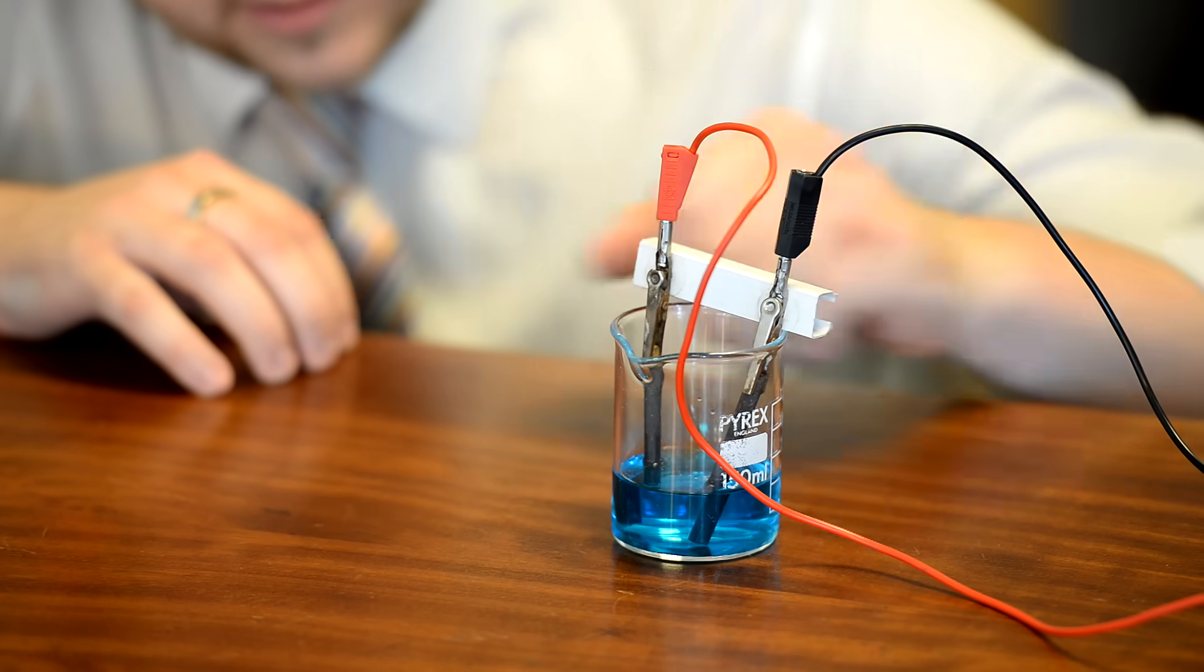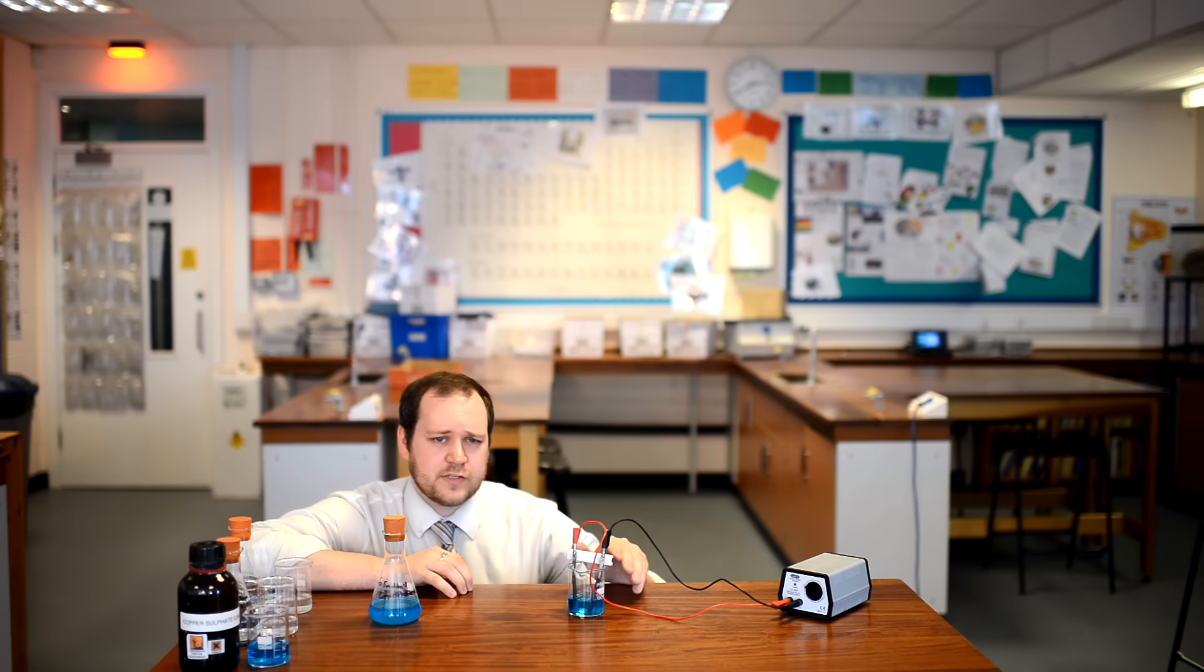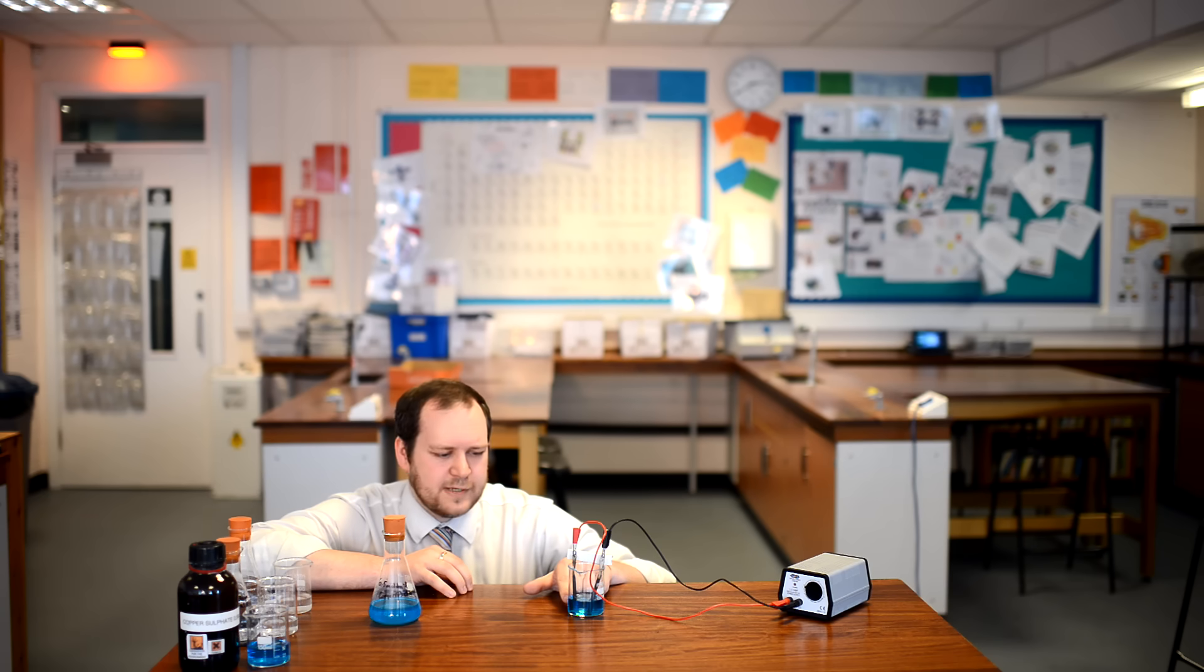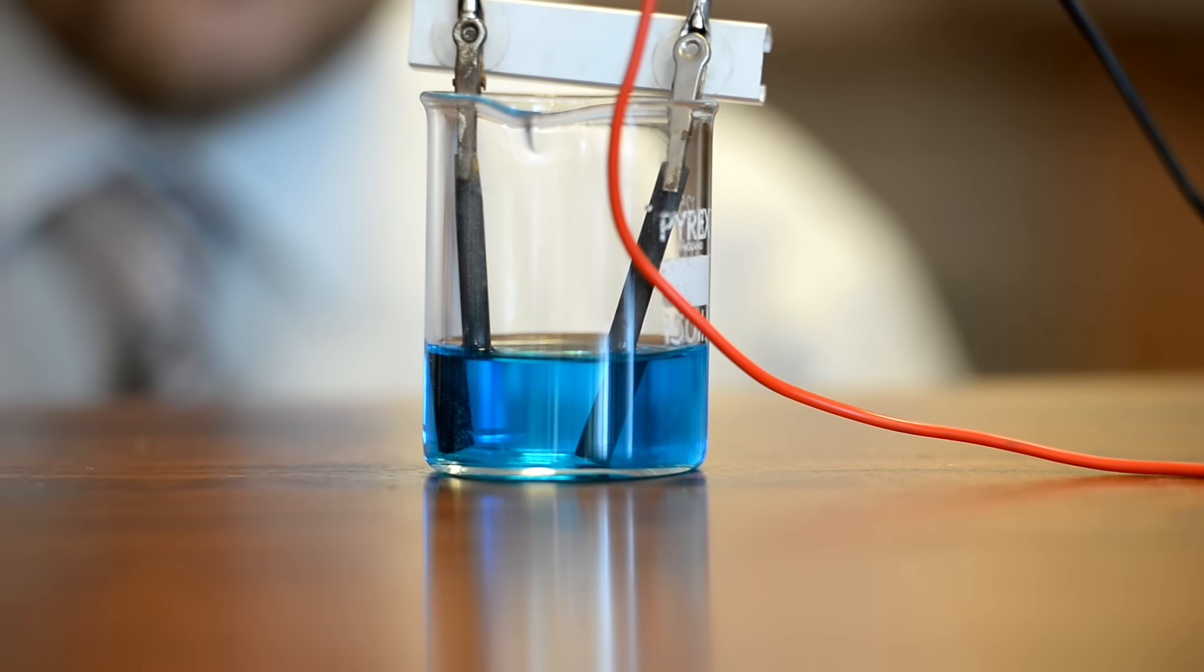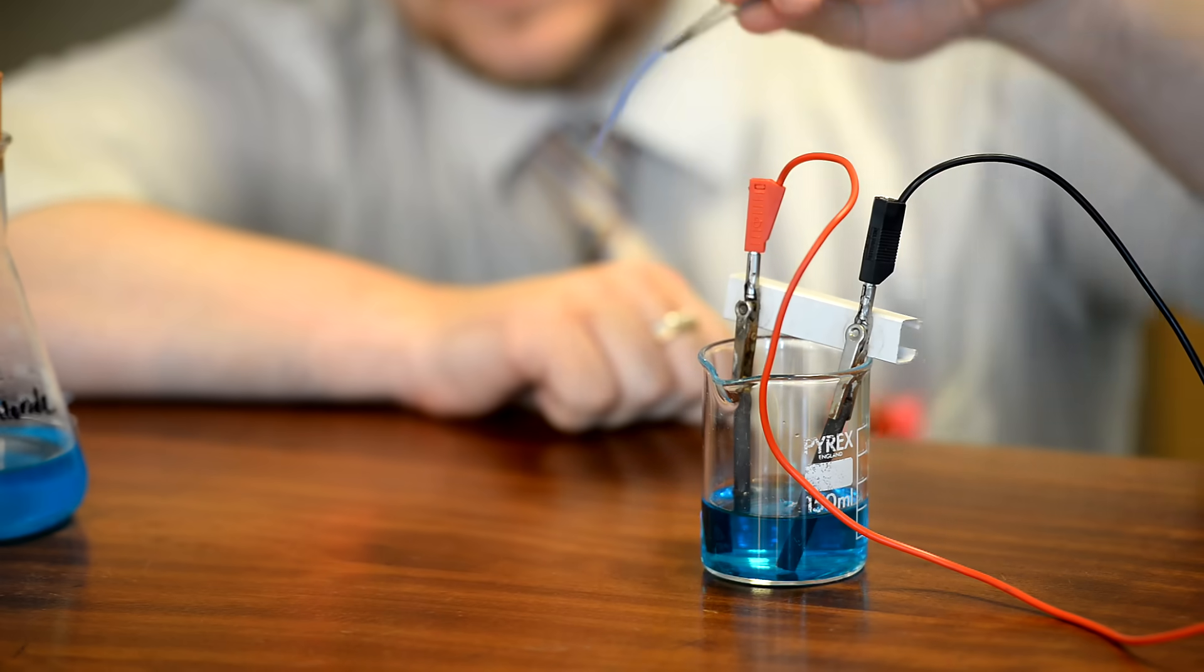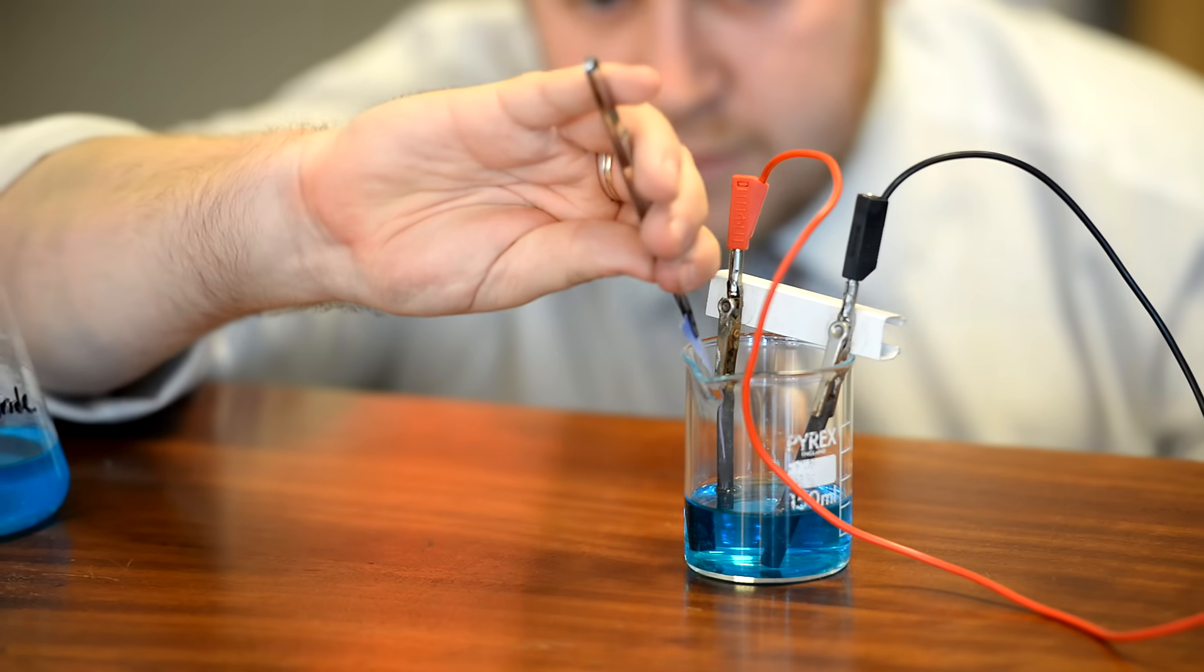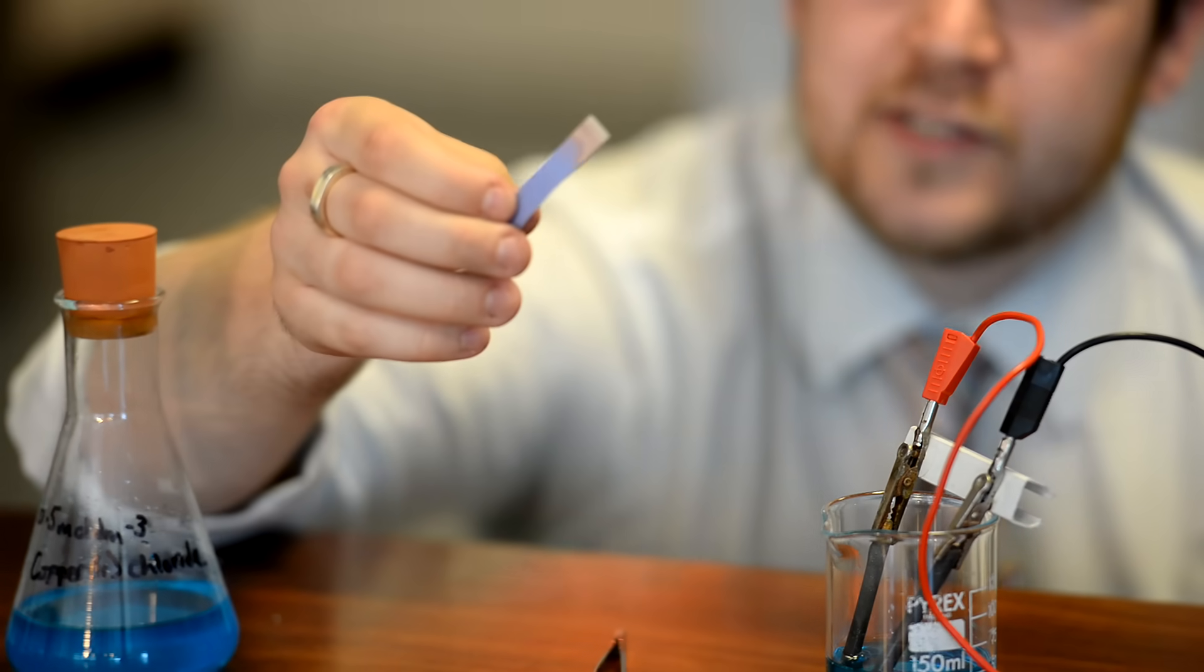The copper chloride contains both copper ions which have a 2 plus charge and chloride ions which are Cl minus. Now what we would expect to see is that at the positive electrode we're going to have a gas being formed and we can see that with bubbles. Now in order to test for the chlorine ions, we're going to hold a piece of blue litmus paper just above the anode. And what we should see where the chloride ions have formed chlorine, the litmus paper is bleached. The bleached litmus paper shows a positive test for chlorine.